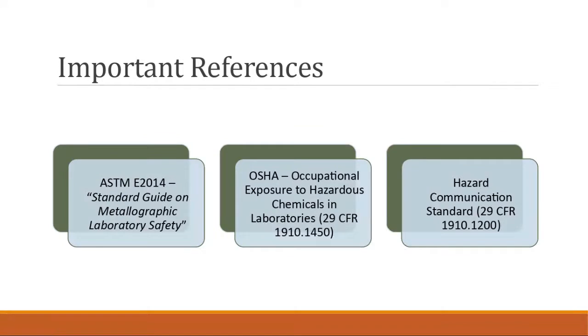You're looking at ASTM E2014, the standard guide on metallographic laboratory safety. Then OSHA's occupational exposure to hazardous chemicals in laboratories, and also OSHA's hazard communication standard.